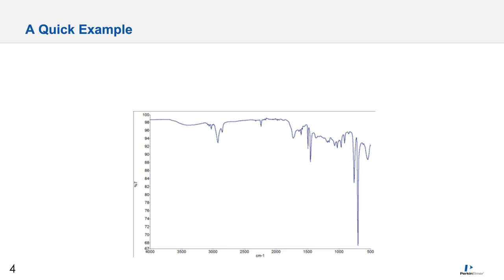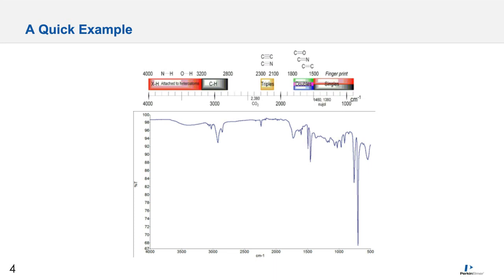Now understand that when performing material analysis with an FTIR or an infrared microscope, that manual spectral interpretation is not always a requirement for material identification. In many cases, users will either run a comparison by calculating correlation between a known sample and the tested sample, or they will perform a library search, a sort of dragnet approach to the identification process. But here we'll go through an interpretation of the spectral features manually.